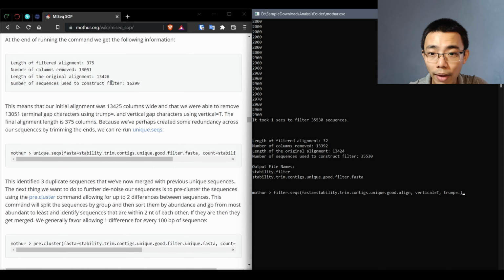So once we're done with the pre-clustering and removing all the chimeras, now we have 2,500 sequences. We need to know where they are from. So classify sequences is a way to understand what the genus and species are. I think it only goes out to genus. What genus, family, phylum all the individual sequences are coming from.